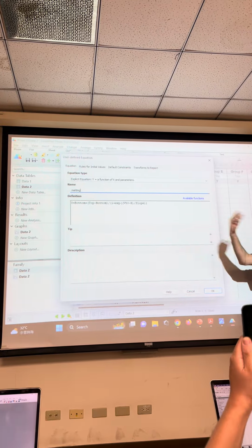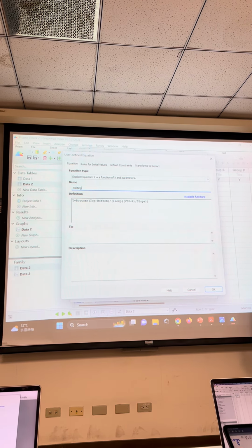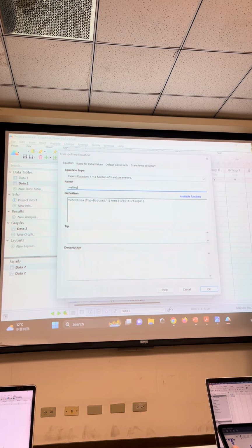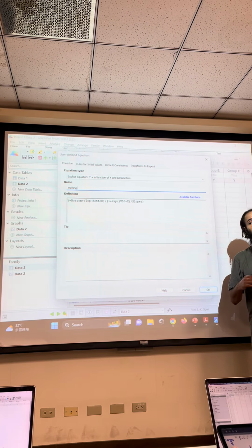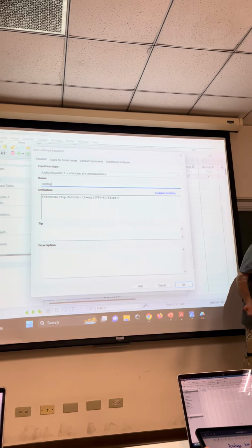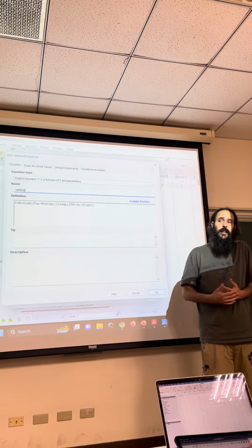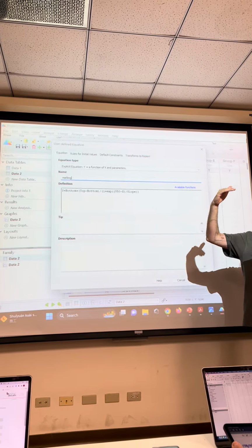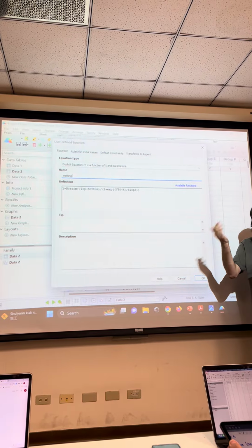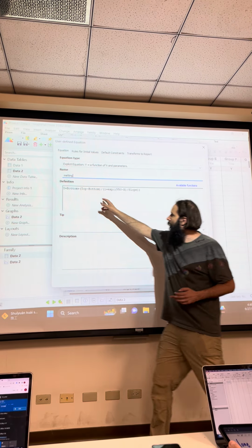Remember, because in the case of the traditional equation from what's his name? From Anfinsen, okay? He considered that you were going to go from 0% denatured to 100% denatured. But we don't have that. We just have a signal from the CD spectra, isn't it? So that means that our signal starts somewhere and it ends somewhere. It starts at something like minus 35 and ends at minus 16. So we cannot just go from 0 to 100. We have to go from where it starts to where it ends. Okay? So that's why we have this as our coefficient.